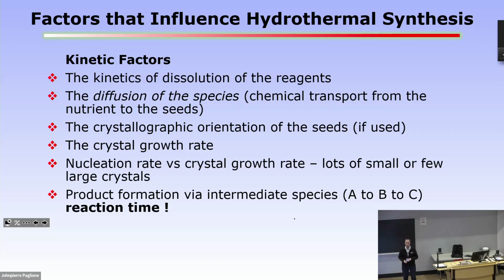So we always think that you heat up to dissolve, and then you give it a chance to nucleate, and then you cool. The time at which you just hang out and soak really does depend and influence what comes out. You can get intermediate species. Dermot O'Hare, I guess in the early 90s, did in situ synchrotron studies in England on hydrothermal reactions. So they took a Parr bomb and milled down the side walls to less than 1 millimeter thickness, actually a fraction of a millimeter, and convinced his safety people that that was still plenty to hold in the pressure.